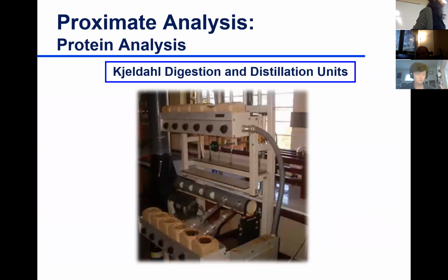This is a very old Kjeldahl unit. That's what I used when I was a student. It's funky looking, but it does the job. So here is the digestion, and it's also linked to an exhaust system where it's trapping the fumes. It gets digested here, and then the fume goes up and gets collected here.